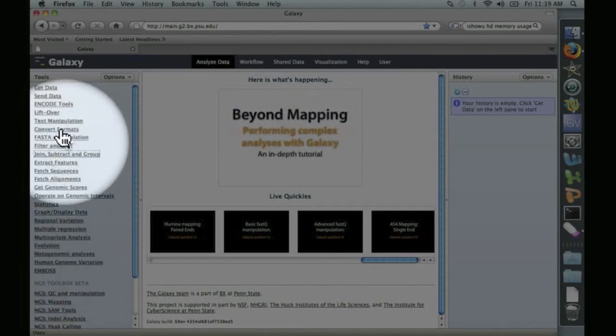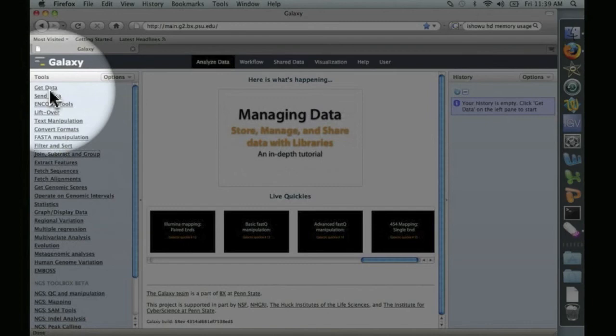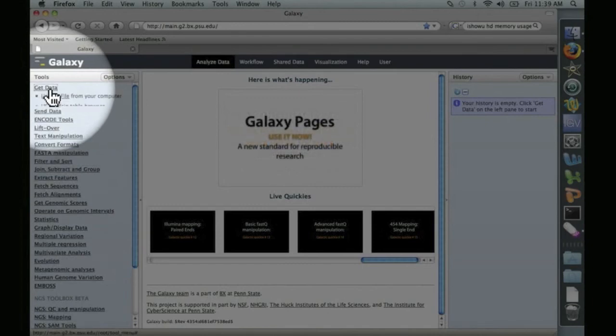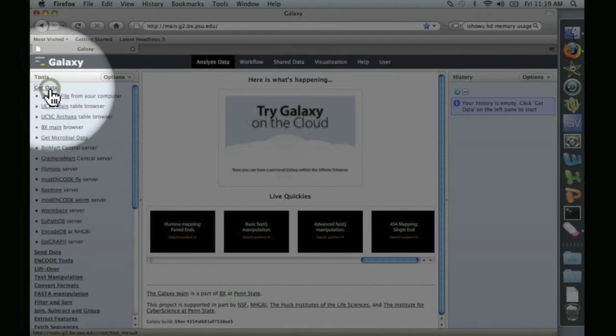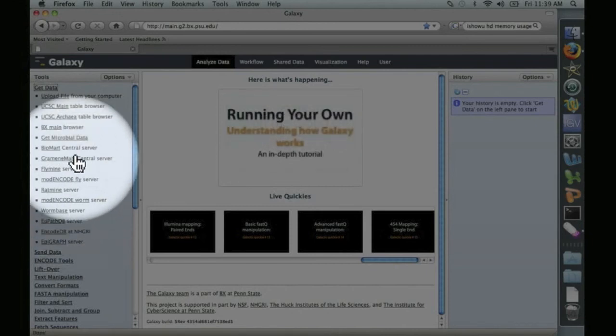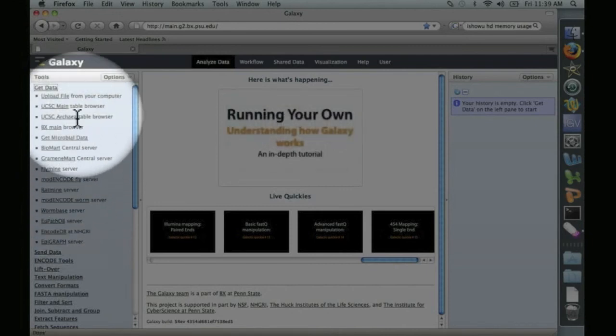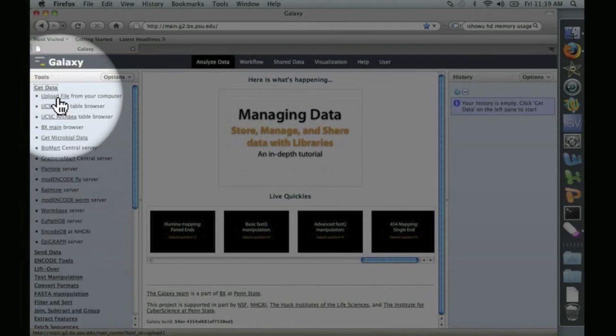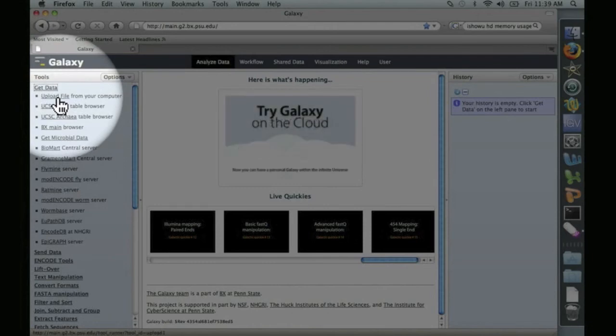What we're interested in is here at the top, get data. Let's go ahead and click on that. And you see here a list of servers from which you can transfer data directly to Galaxy. Also at the top, there's upload file from your computer. Let's click on that.